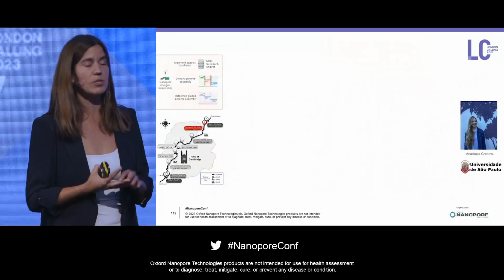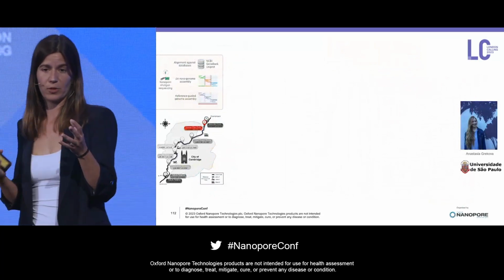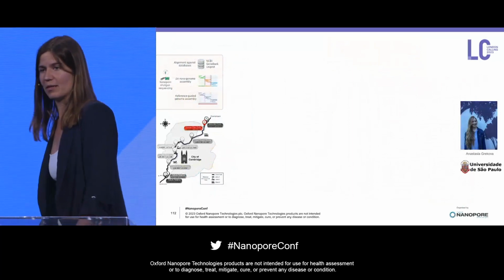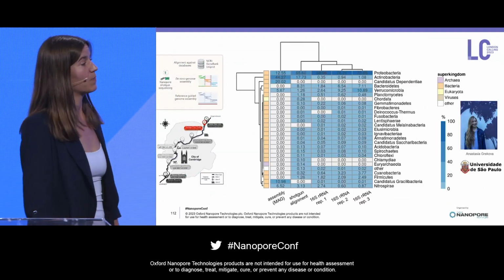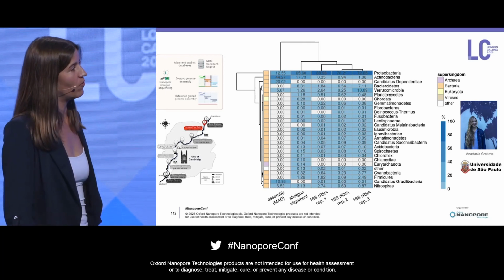And we can also use the shotgun sequencing data and just align it to databases to get a quantitative idea, or to do reference-guided assemblies. So we went back to this sewage pipe outlet that we were interested in, in Cambridge, and processed the water both by shotgun sequencing as well as by 3 replicates of the amplification-based approach that I just showed you before.